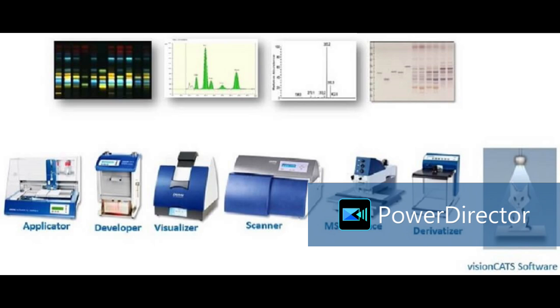So what will this do? You will get a comprehensive idea of exactly which wavelength this component is absorbing. And for detection, this is the detector, so we can detect how many bands and how many components are there. If we capture only in a single wavelength, then we will understand only whether they are absorbing white light or not, or UV light or not. But if we capture under 3, you'll get a holistic idea that this sample has this many components, some are UV active, some are fluorescent, some are white light active.